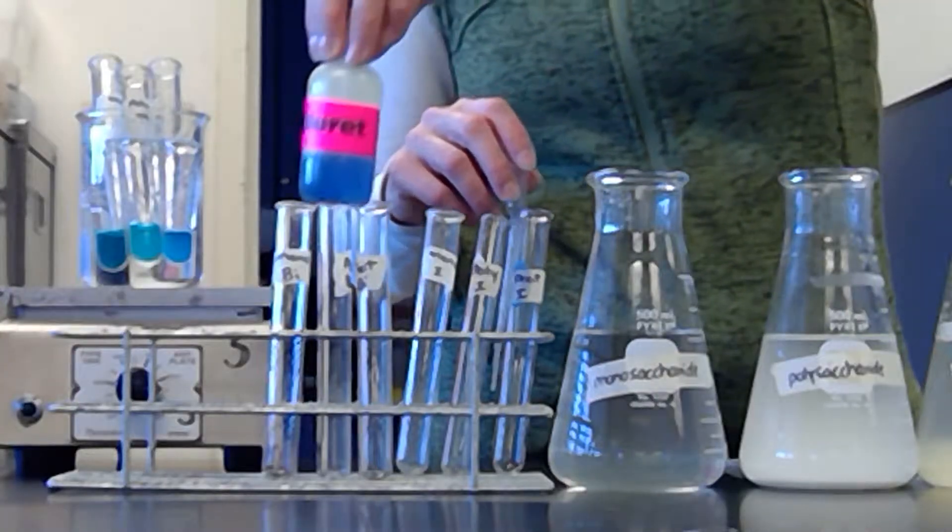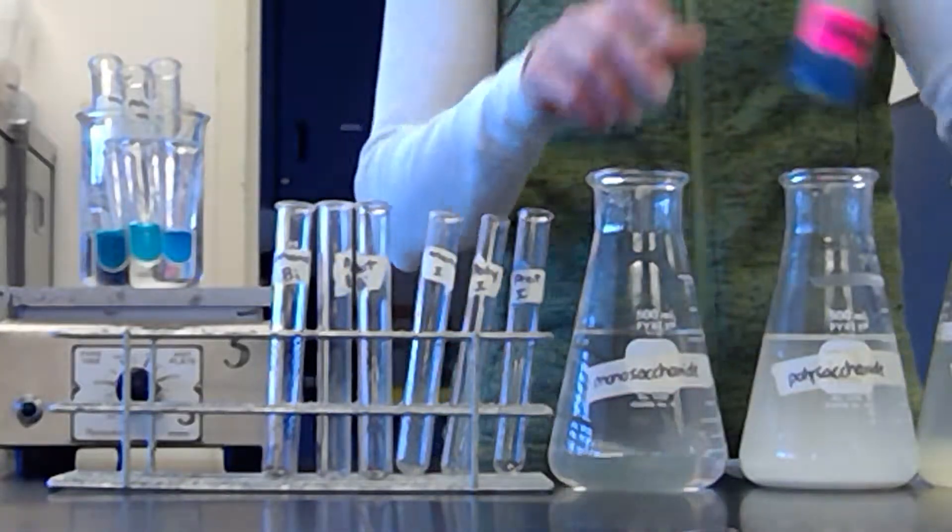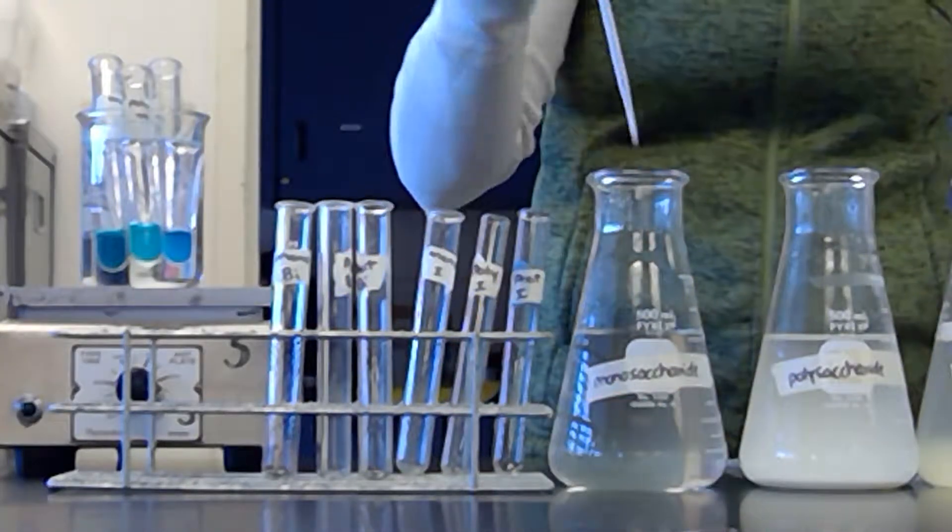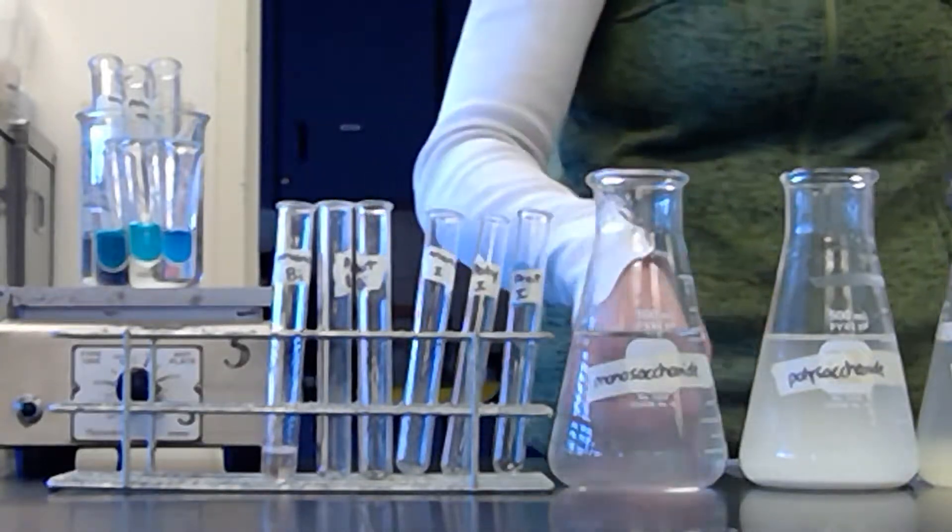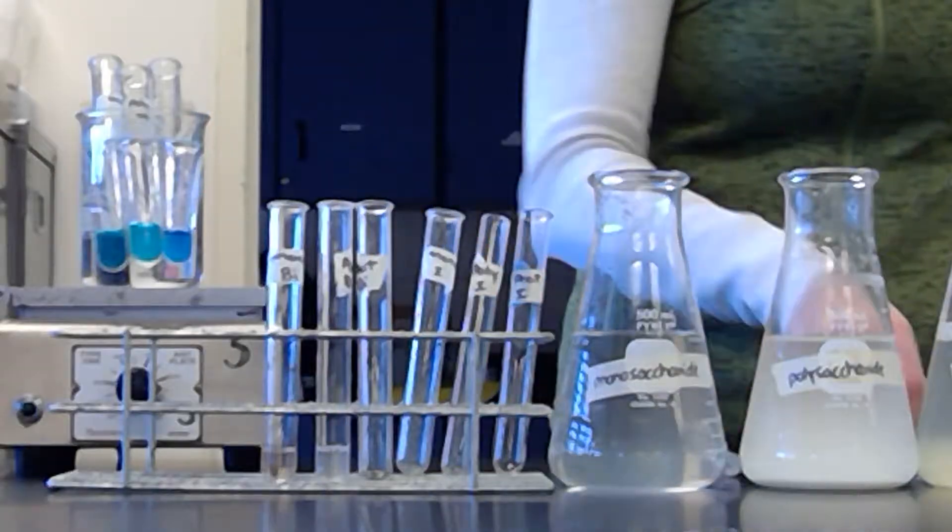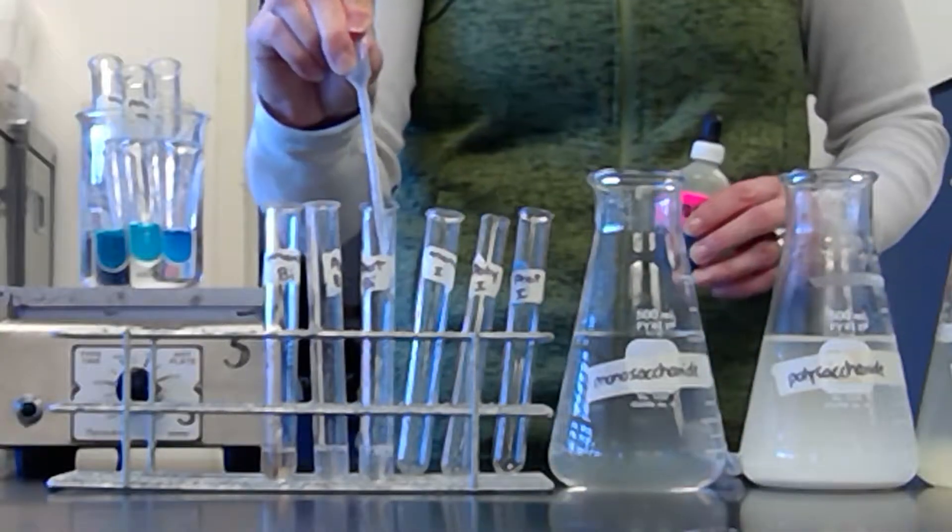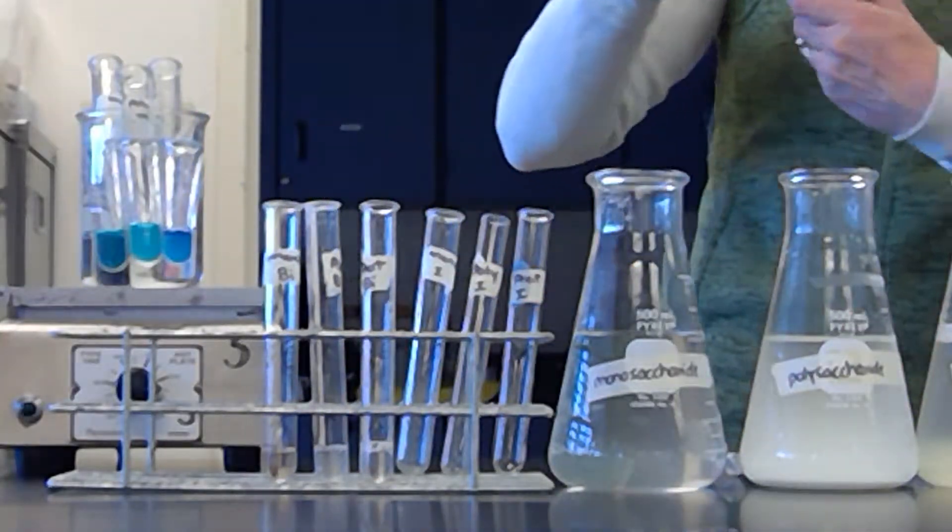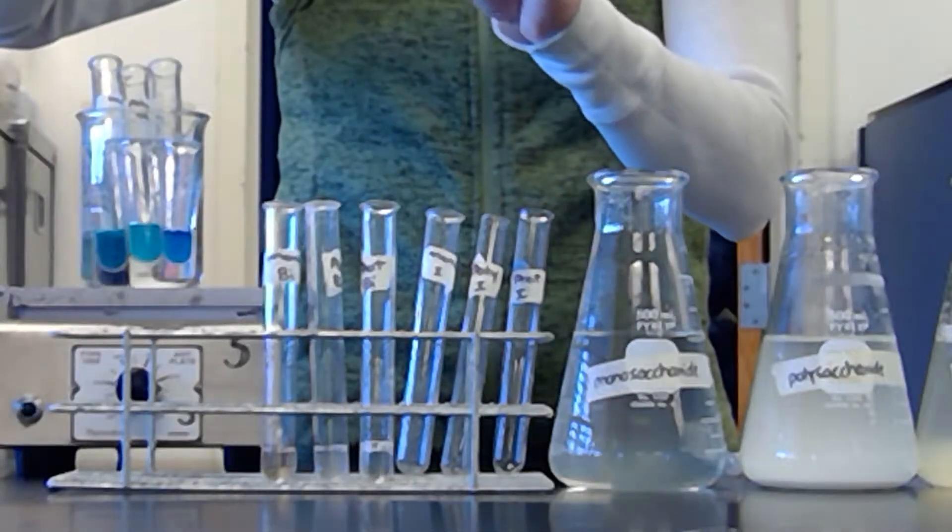And now I'm going to take the biuret. And remember, it was like this weird kind of purpley. The other was more of a bright blue. So I'll just take a squirt and I will add these in. So I have my monosaccharides, I have my polysaccharides, and then I have my proteins.